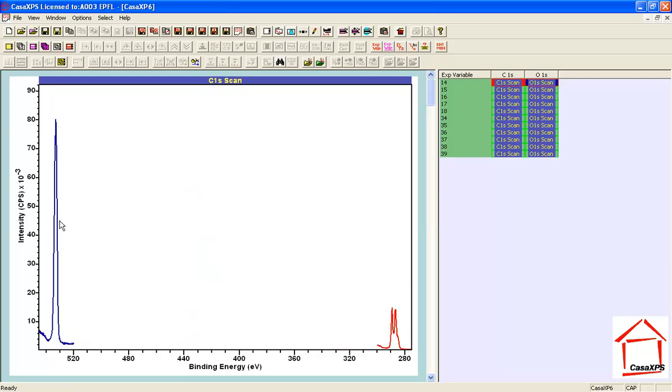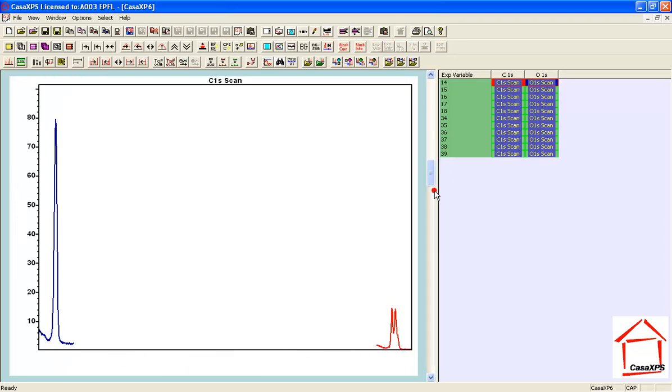So I have the oxygen and the carbon in each one of these display tiles that is based on the row VAMAS blocks selected in the right hand side.